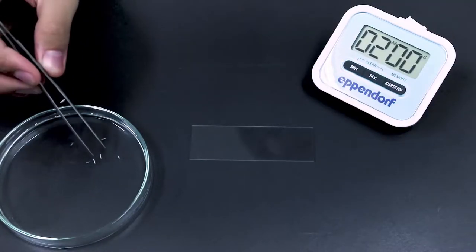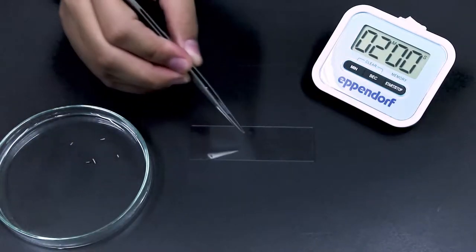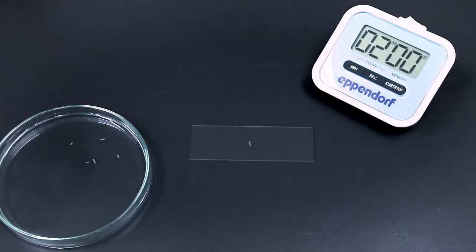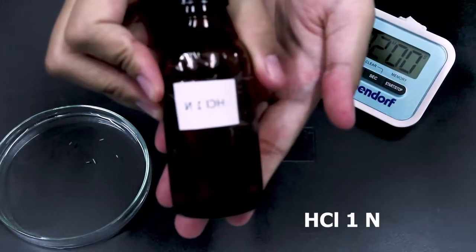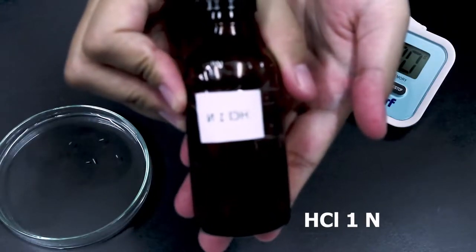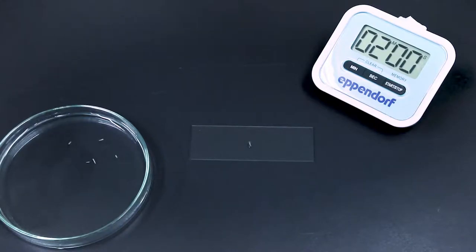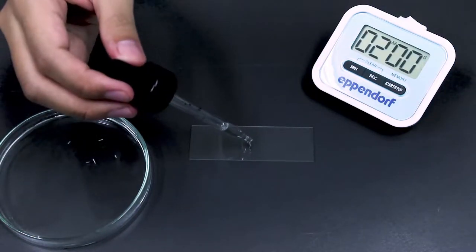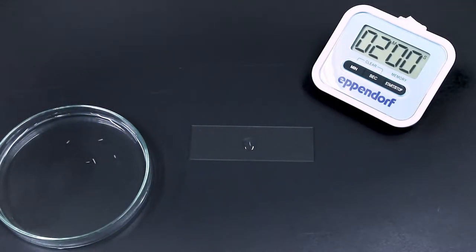We have this slide here, so you just pick one of the root tips. It's a bit difficult to pick up. Set the timer for two minutes. We're going to use the hydrochloric acid or HCl, so you can just drop one or two drops of the HCl onto the root tips on your slide and leave it for two minutes.